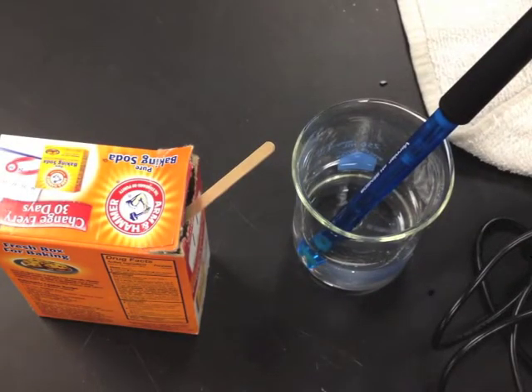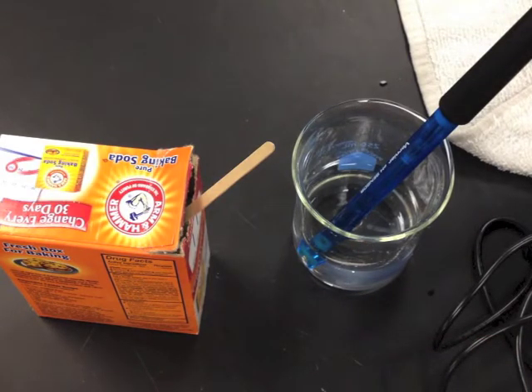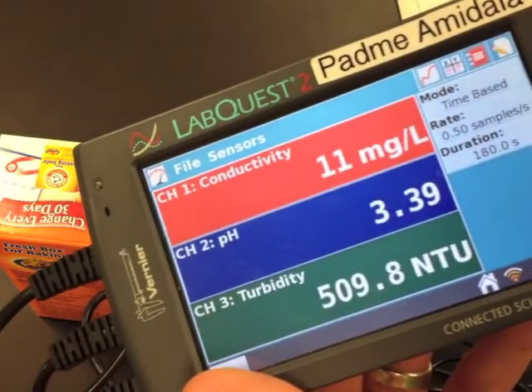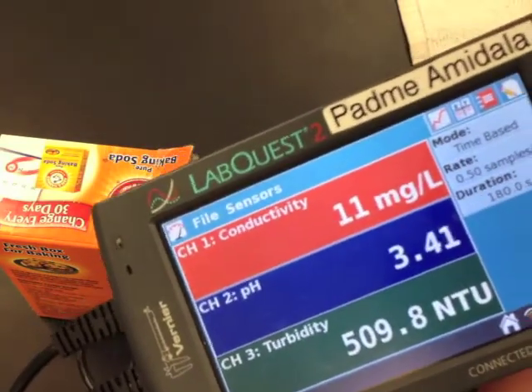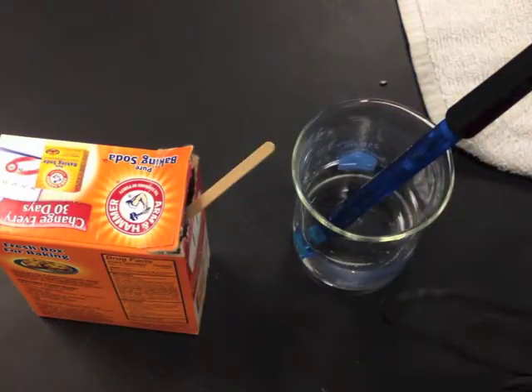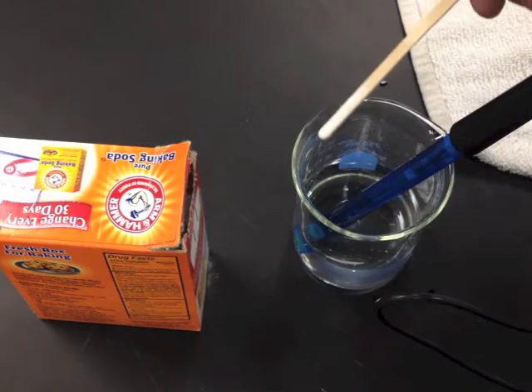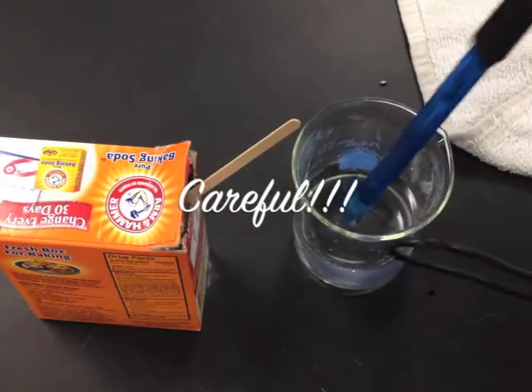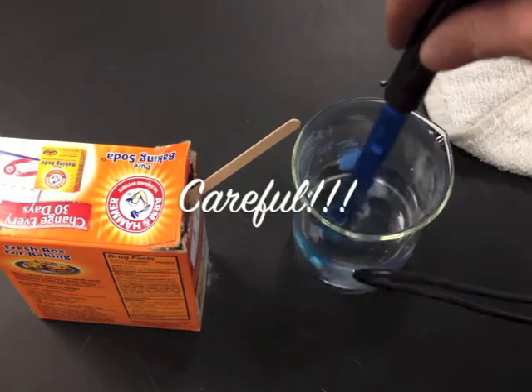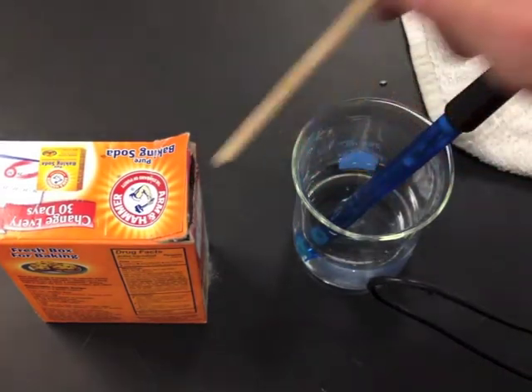After running all three tests a third time on the filtered water sample, you're going to do the last step — pH adjust it before doing your tests a fourth and final time. The pH of my water sample is about 3.39, and I need to get it to about neutral — pH 7 is neutral, and I want to raise it to about 7.5. I'm going to carefully add small amounts of sodium bicarbonate, just using a very small amount at a time.